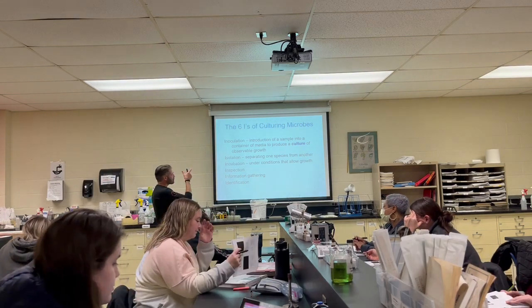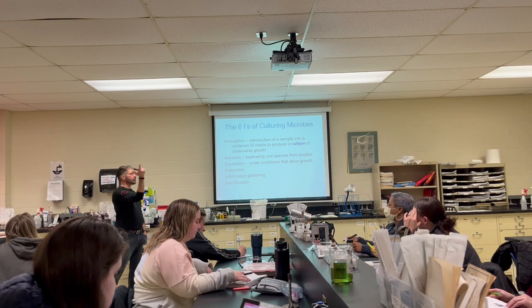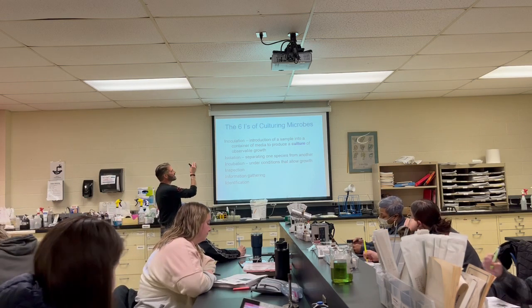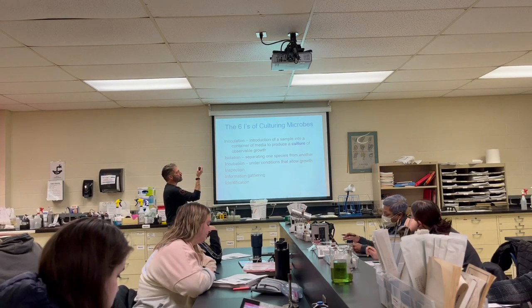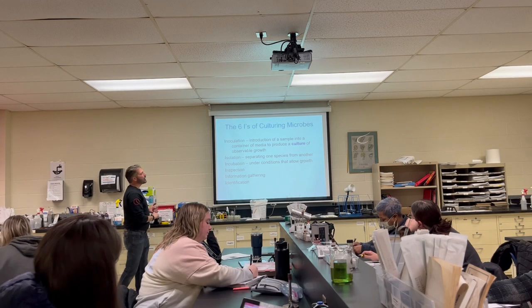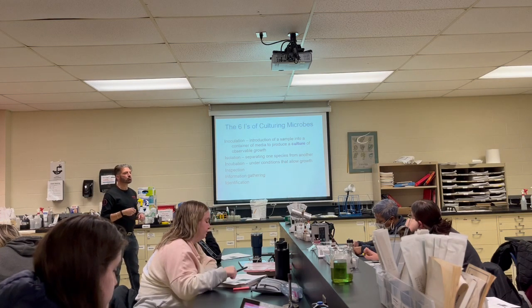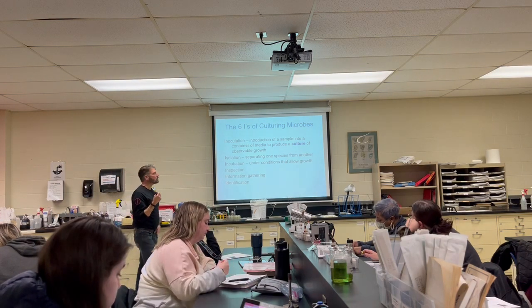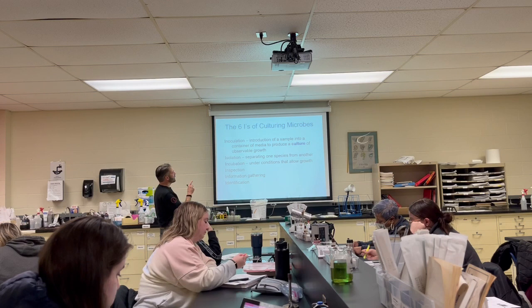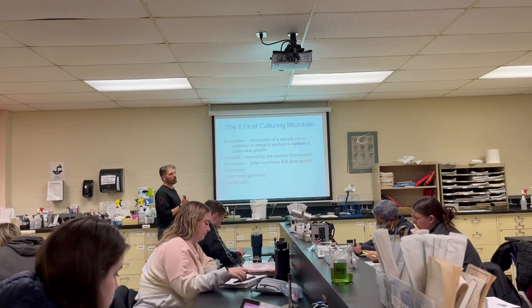All right. So I will be asking all of you some version of this question too. So I want to know the 6 I's of culturing microbes. All right. So just kind of think about it for a second. Inoculation. So I want to inoculate something. So I'm going to just swab something. Right? Introduction of a sample into a container of media to produce a culture of observable growth.